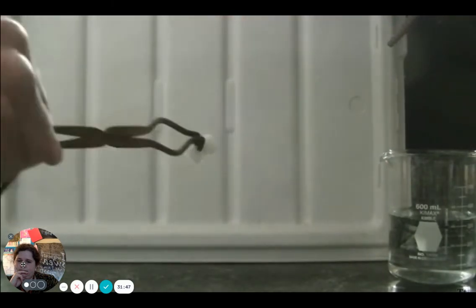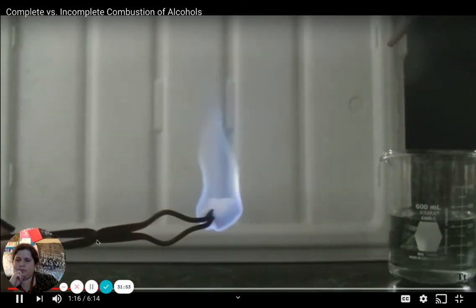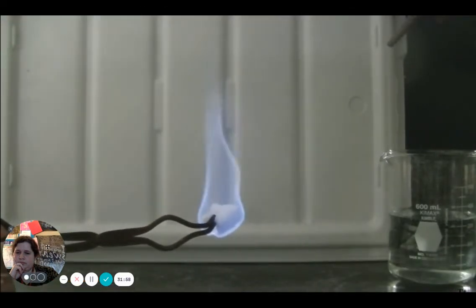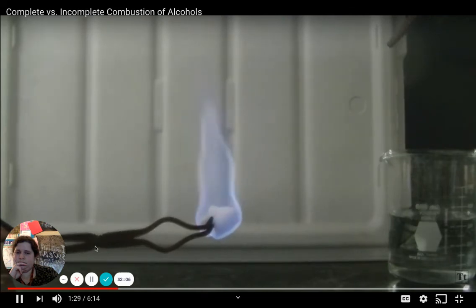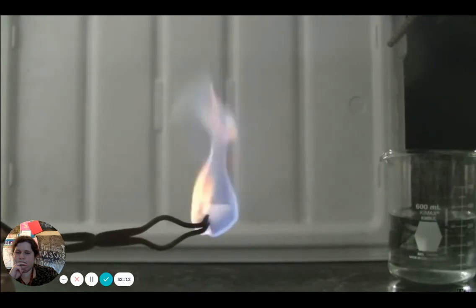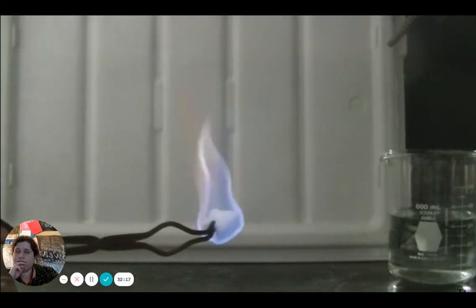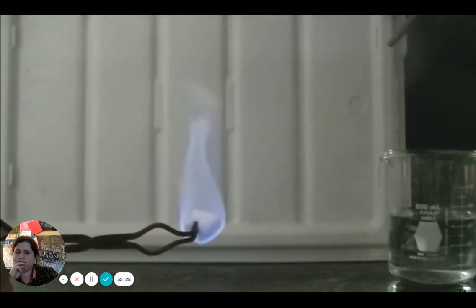We'll light this on fire. And what you note is primarily a blue flame. Now, blue flame is indicative of complete combustion. That means that the methanol is being completely converted chemically into carbon dioxide and water. You might notice a few flecks of orange and yellow. Those are regions of the flame where the methanol is being incompletely combusted, and in that case, there's some soot formation. And when soot gets hot, it incandesces or glows an orange-yellow color. But mostly, what we see here is a blue flame indicative of complete combustion of the methanol.